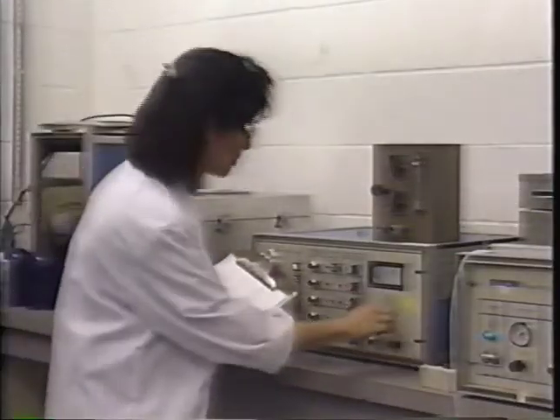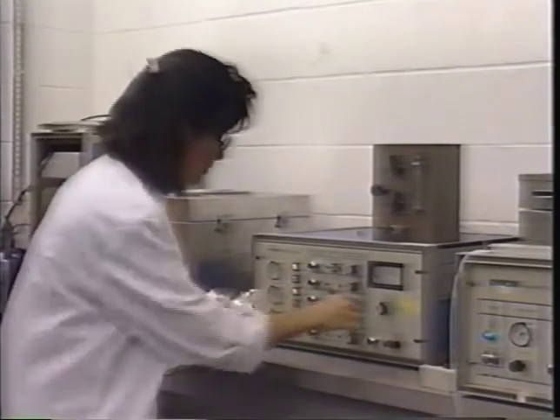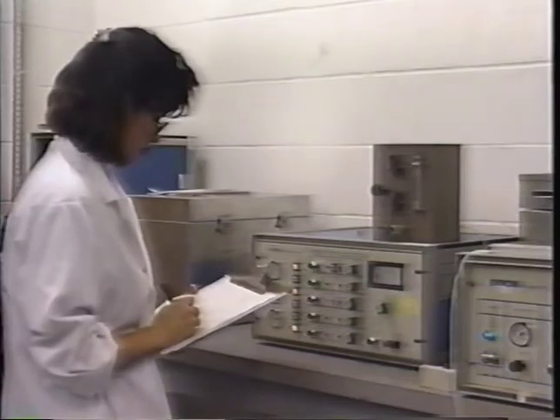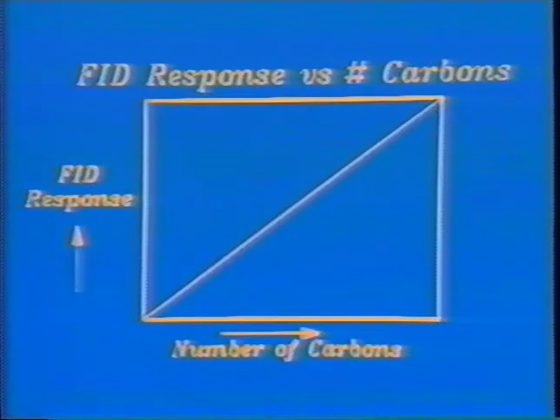Several detection techniques respond to organic compounds. However, the response can vary widely from compound to compound and therefore may not be proportional to the total organic mass or volume in the mixture. Such is the case for the flame ionization detector, or FID, the most commonly used detector for the measurement of organic compounds. The response of the FID to VOC should increase in a linear fashion with the number of carbon atoms. That is why the FID is known as a carbon counter.